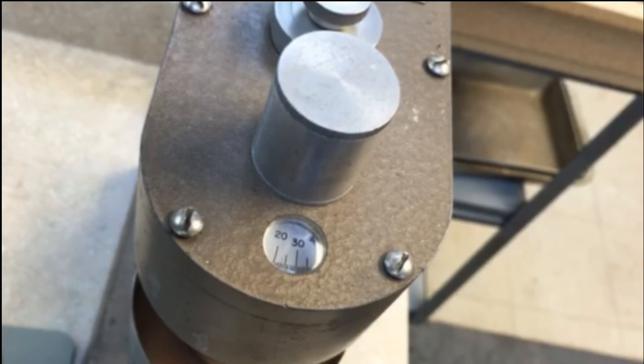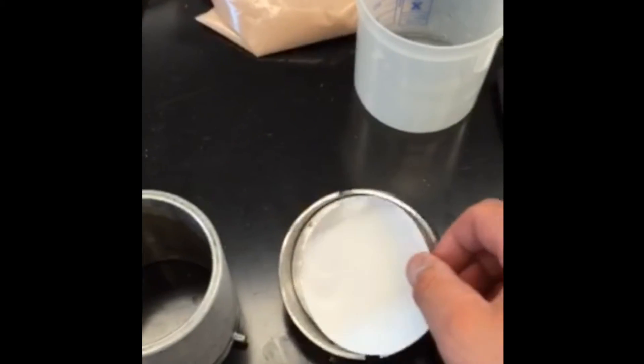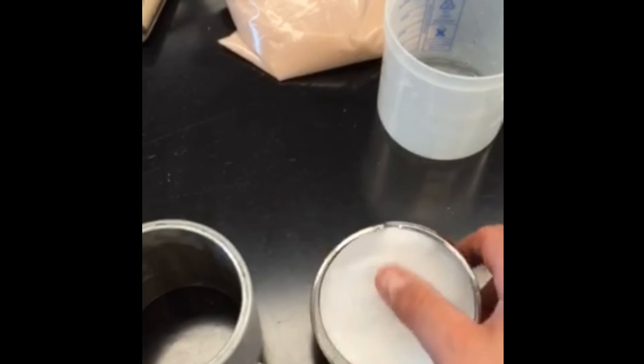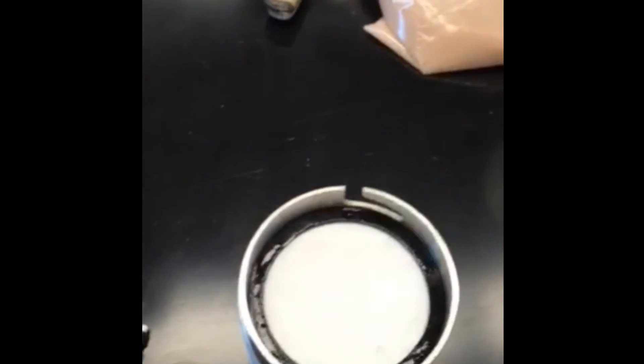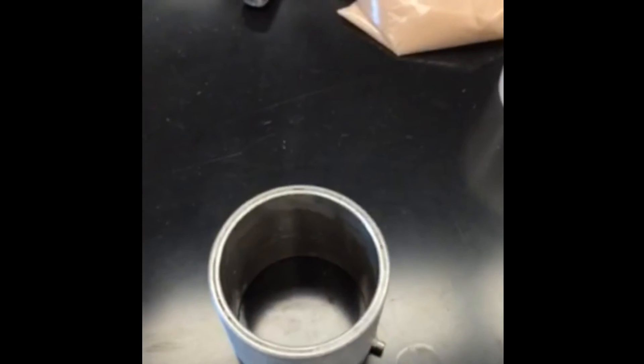We do that at different speeds. You can see the speed and the viscosity showing up there on the dial. There are various speeds with this, and the API spec calls for testing bentonite at a couple of different speeds. So we test it at low speed, then increase the speed and measure the viscosity and also the ratio.